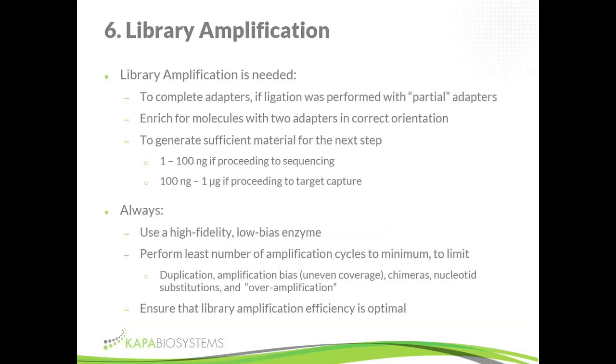So if you only need a microgram of DNA, don't keep on going until you have 5 micrograms. All that you're going to do is create more duplicates, and duplicate reads in the end are going to get thrown out, so you may reduce your coverage, and you're definitely reducing the evenness of your coverage the more PCR you do.